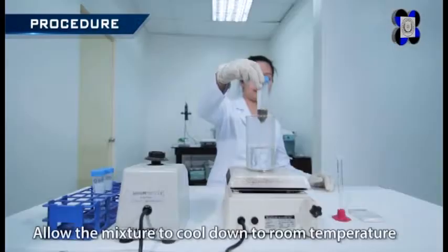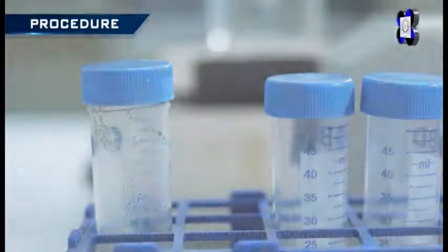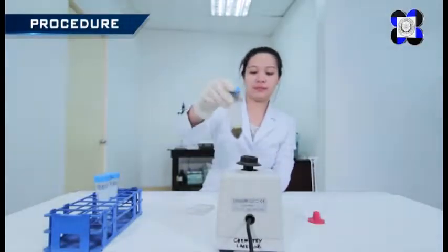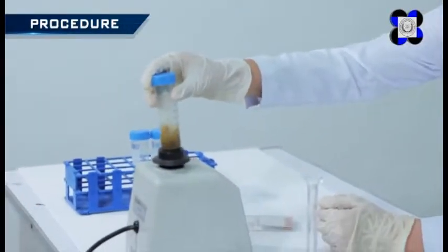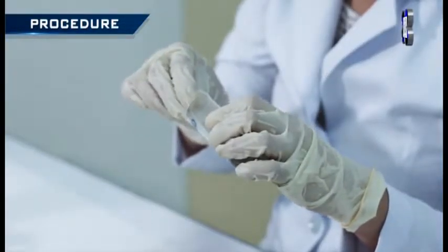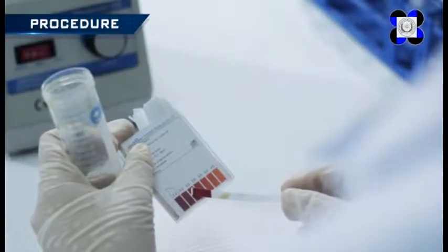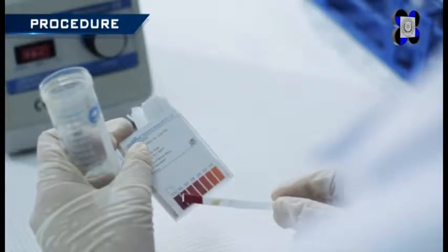Allow the mixture to cool down to room temperature. Then check again the pH. The pH should still be within the desired range. Adjust the pH if necessary following the same step demonstrated earlier.